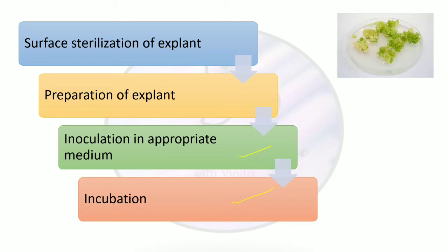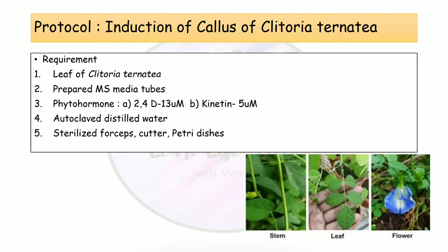Okay, so now I'm going to provide you specific data which you can use for the induction of callus in a particular plant, namely Clitoria ternatea. I have also mentioned the picture right here. You can use it as a reference.